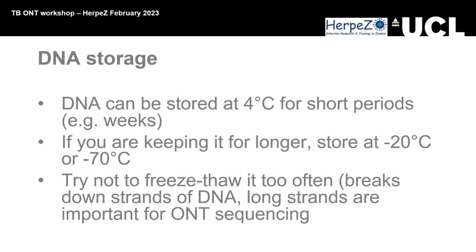You have to try and remove as much ethanol as possible, but at the same time you're trying to see the pellet. You've got to have very good eyesight, so you don't want to suck up the pellets. Exactly, it's a balance. If in doubt, I would leave it in, and it will just take much longer to evaporate. Yeah, overnight. If your room is warm, then that helps. But if your room is air conditioned like this one, then it will probably take a bit longer because it's cold.